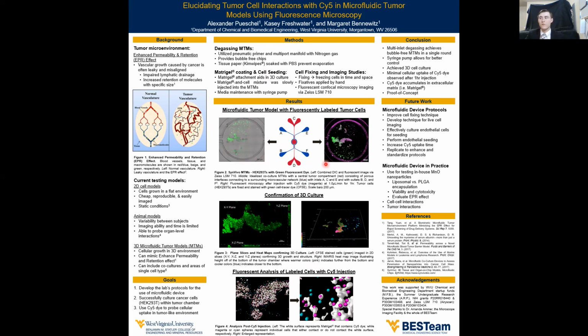What do we want to do moving forward? Well, we want to further develop our protocols by improving the cell fixing technique, but even further, we want to build on that to take live imaging so we can see how the system changes with time, even up to 24 hours. We want to effectively culture endothelial cells and even seed them in this environment in the vascular chamber in the blue. And that will give us a better representation of the EPR effect.